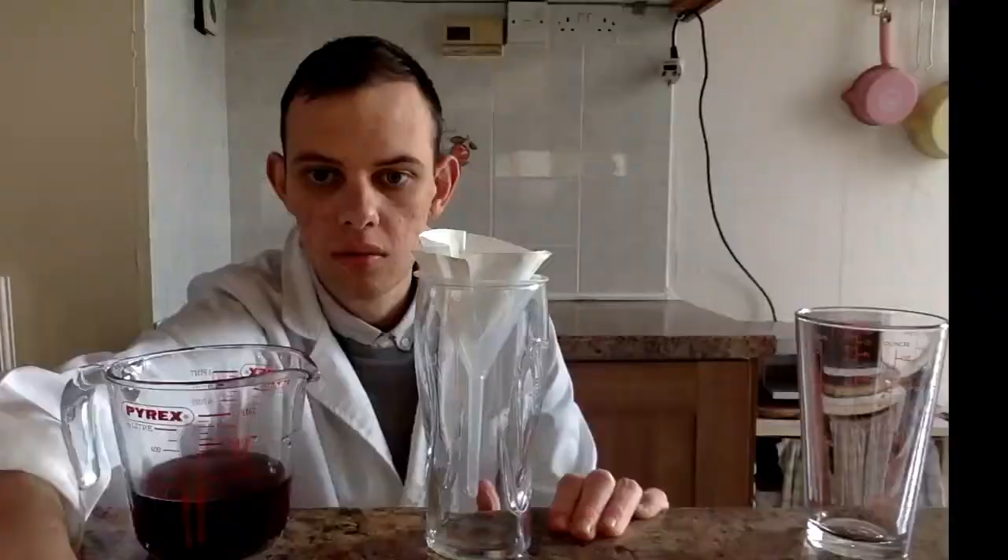After filtering the vanillin, we finally have our product. As you can see, it is a yellow sort of powdery crystal, and it definitely has that distinct vanilla scent to it — very strong as well. Unfortunately my balance is not precise enough, so I wasn't able to weigh or see the mass of my yield. However, as you can see, it is a small amount but it is still visible.